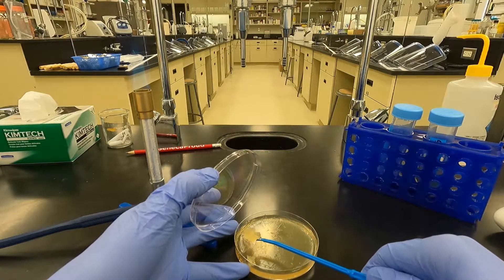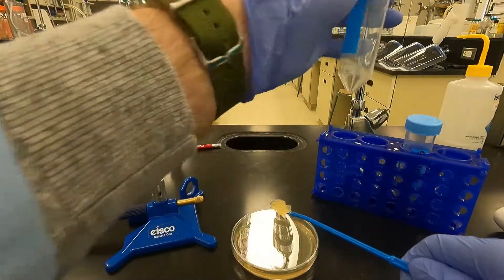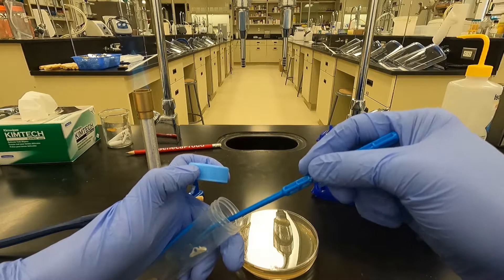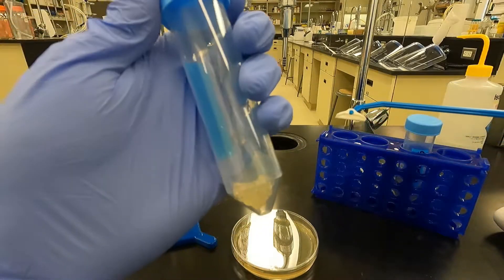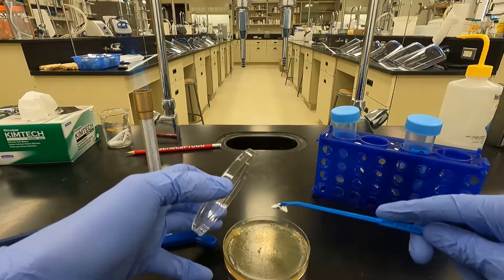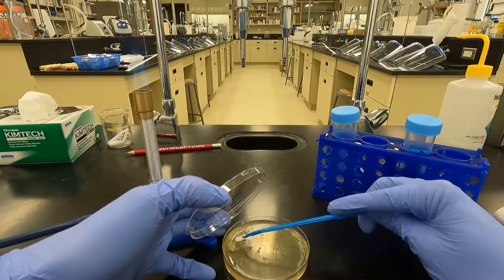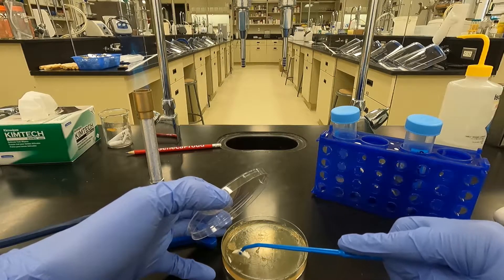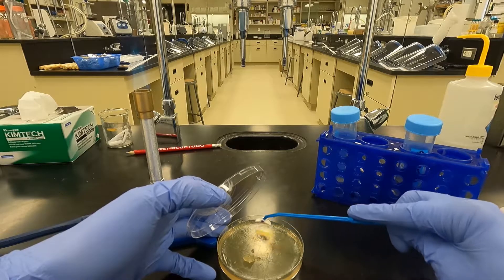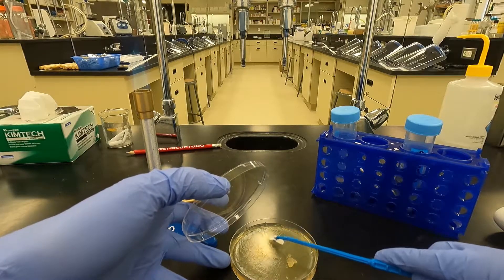I like to just collect it up, scoop it, and place it into a sterile centrifuge tube — this 50mL conical. Just pop it in there. I like to go back and give the plate another gentle scraping just to collect as much as I can, because I want my lysate titer to be as high as possible. Just go along, give it a scrape, collect anything you've missed.